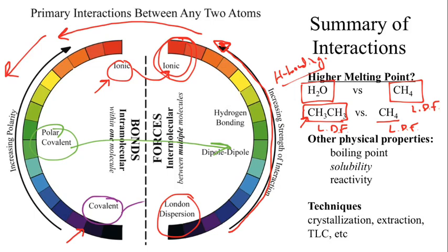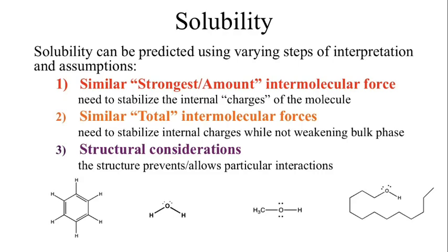We're also going to take advantage of this in conjunction with solubility from however many weeks ago that was, 4 or 5 weeks, to come up with a way to purify. And that's going to be our crystallization technique. So let's go ahead and summarize what we remembered from our solubility. We would rank things based on the strongest force first, if we're going to look at our solubilities. But then we could also push to amount.